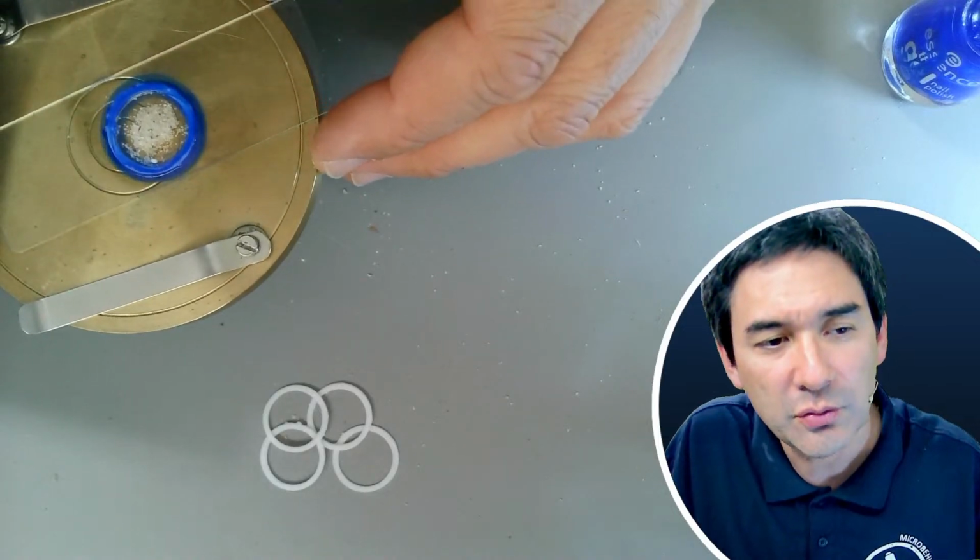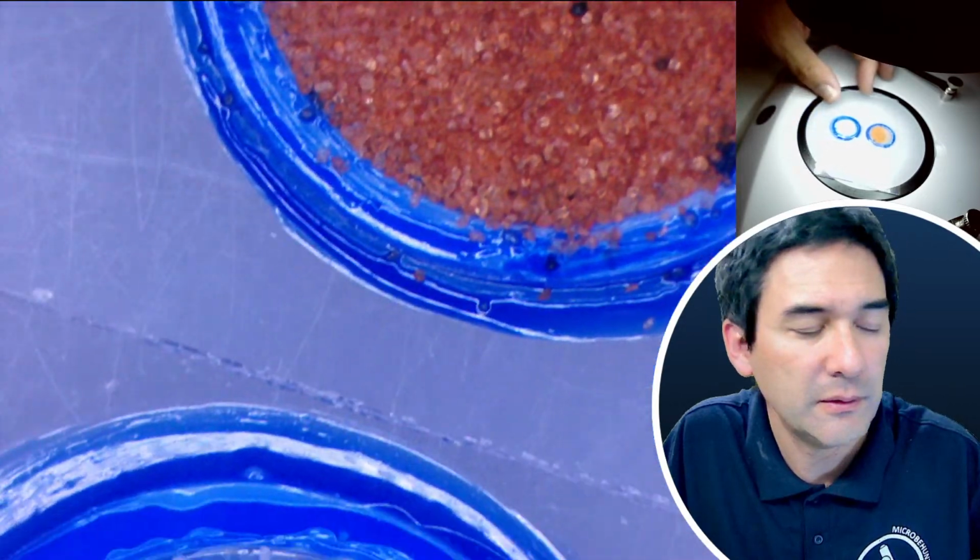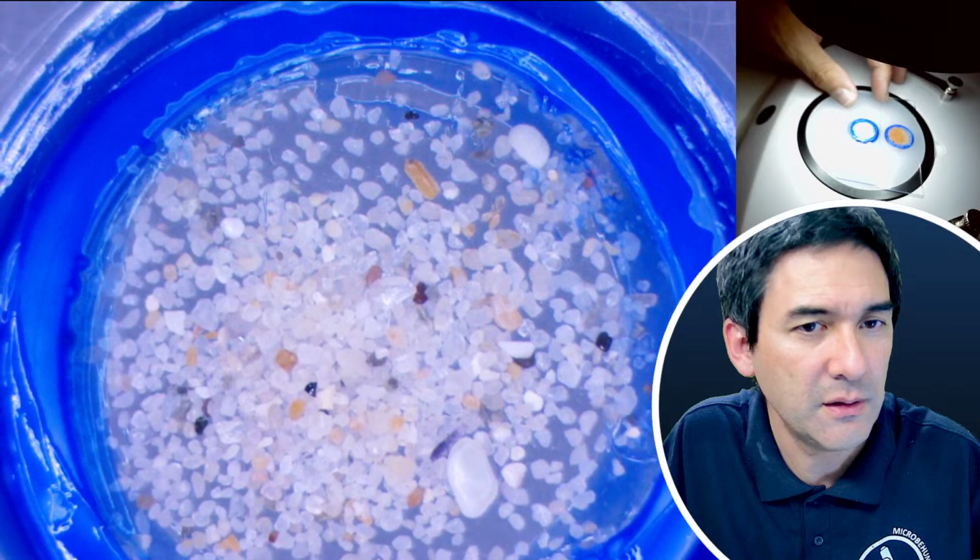So let's now really look at the stereo microscope. That's still the Kalahari, and now this is the other one over here. Here it is, that's the sand from Cape Town.